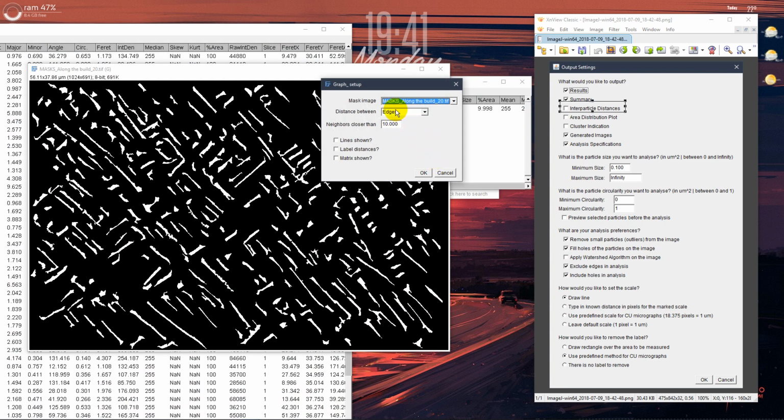And this is the window which, as I say, unfortunately cannot be automated, but fortunately you can specify where the distance has to be calculated from. Is it between the edges of the particles, or you can also select centroids and center of mass. And we've selected in the previous window the value of 1, and here by default it's 10. So we have to change it. For example, I've pasted 1 using Ctrl V shortcut, or you can just simply type it using your keyboard.